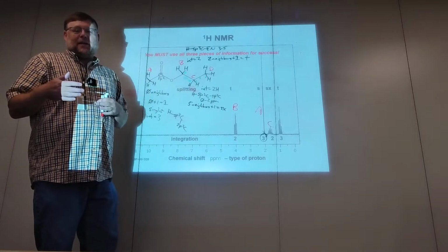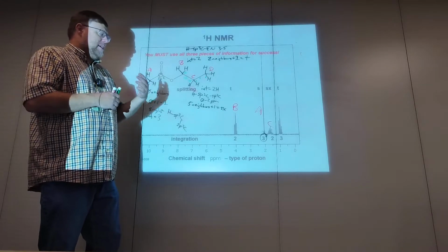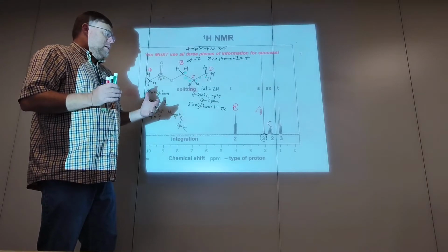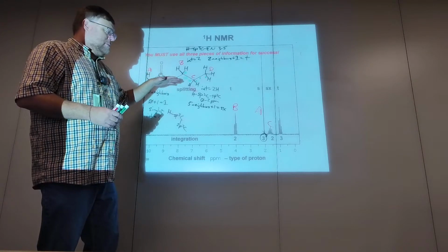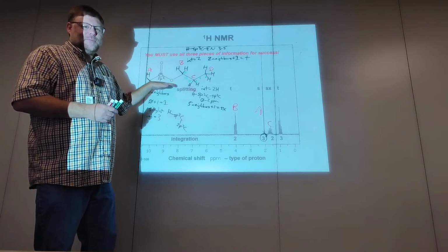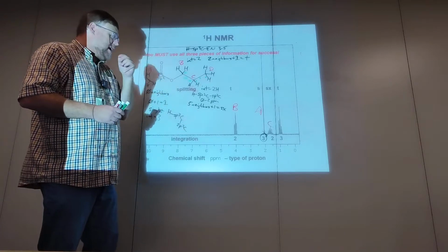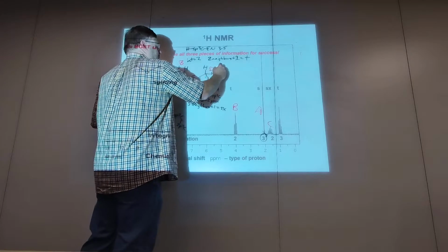But don't just rely on that, right? Look at it. Actually check it. If you've got 10 seconds left on an exam, write D here and move on. But in real life, you don't just say, well, we've eliminated everything else, so it must be that. It could be your molecule's wrong. Think about what you're doing in the lab. In the lab, you don't necessarily know it's this molecule. You're trying to check if it's this molecule, right? This spectrum is how we know we have this molecule. So check the signal down there. Check protons D. So again, integration is going to be for 3.